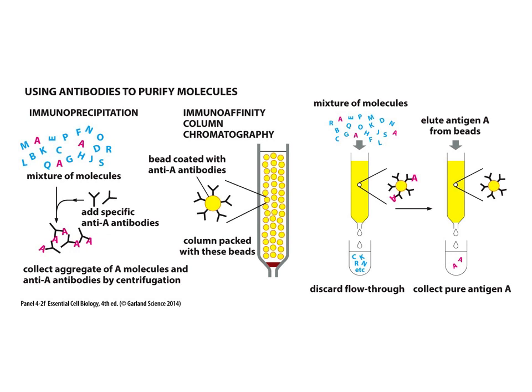Once we add a solution that allows the antibody to stop binding, and usually that's done by changing the pH or salt concentration, because that denatures, it changes the shape of the antibody enough that the binding site's no longer available. We now can collect that pure antigen, and again, for this example, our A's, right? So all the A's are going to be collected here, and we then could follow this up by doing a Western blot to make sure it's pure, or some other technique.